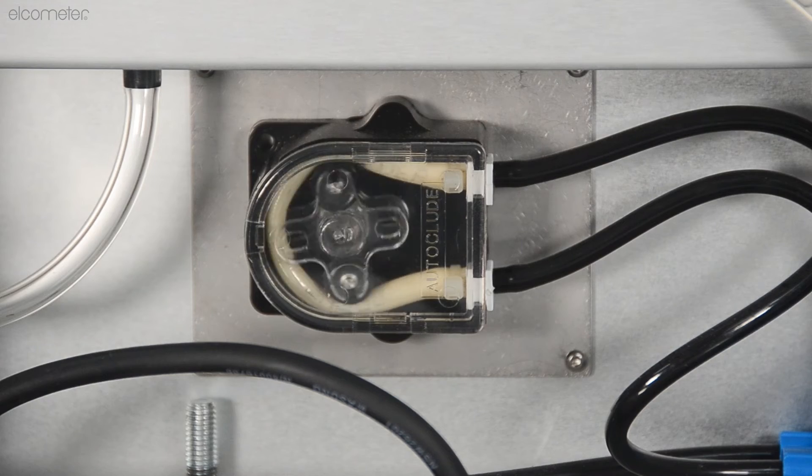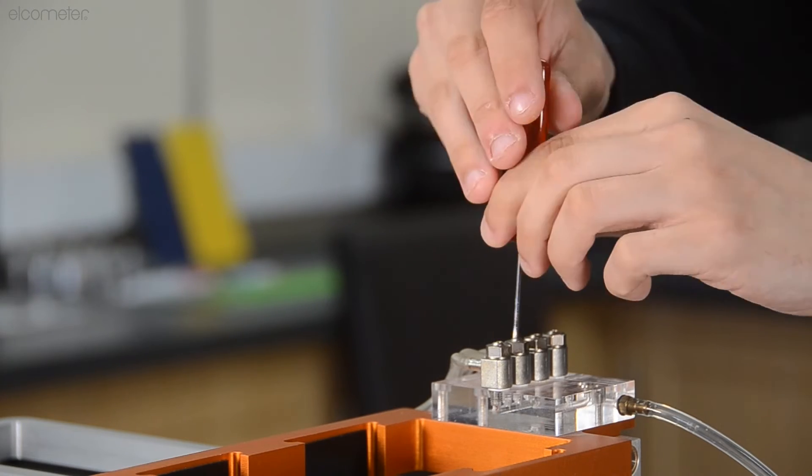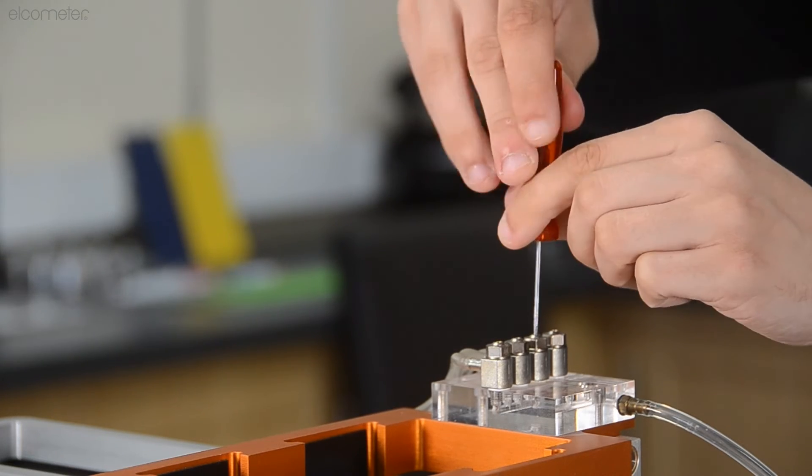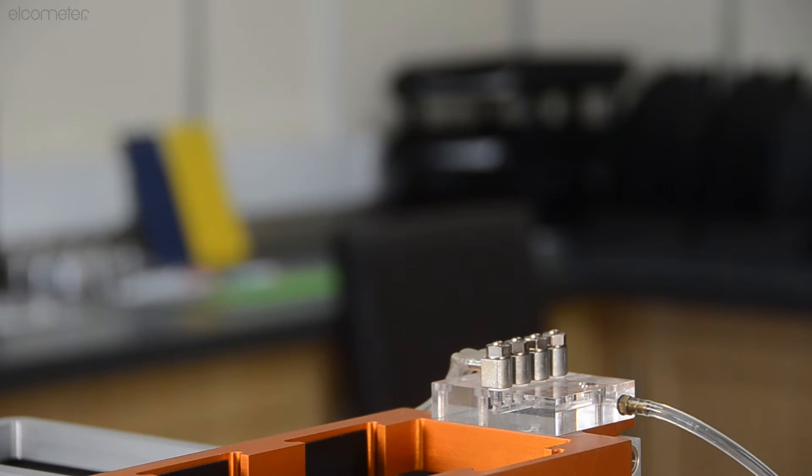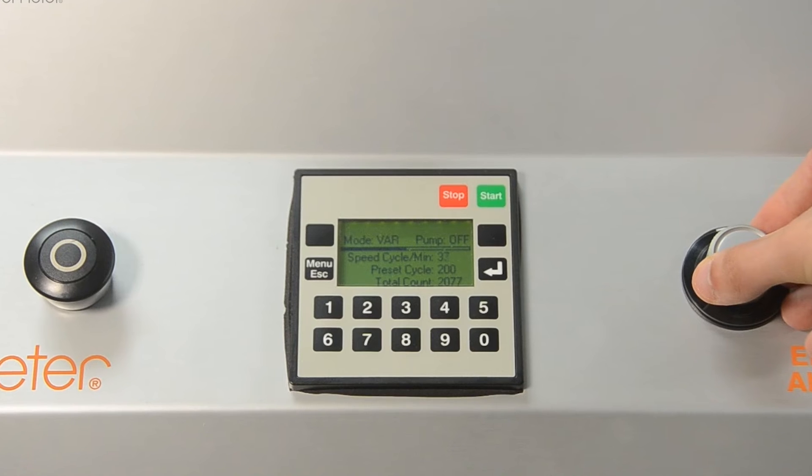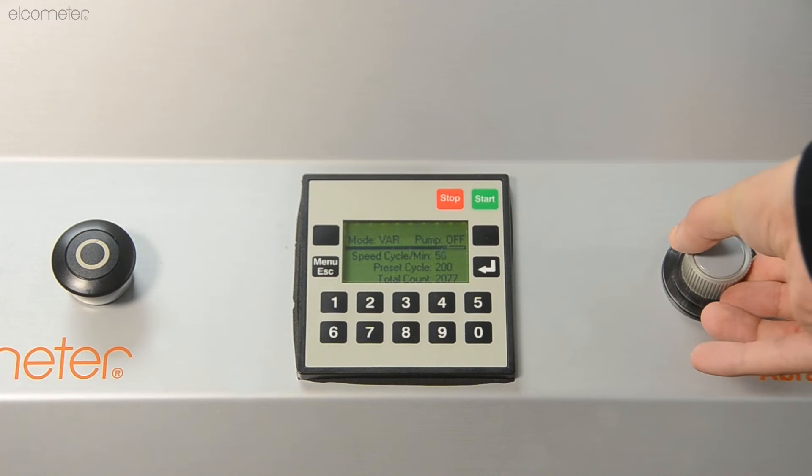Adjust the liquid flow rate by loosening and tightening the flow control valves, working back to front until the required drip rate is achieved. Input the speed and defined number of cycles using the buttons and dial.